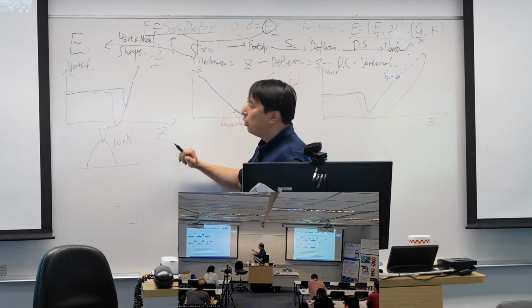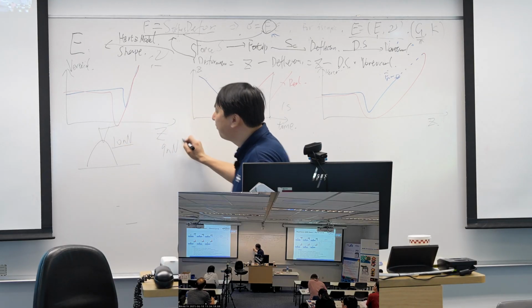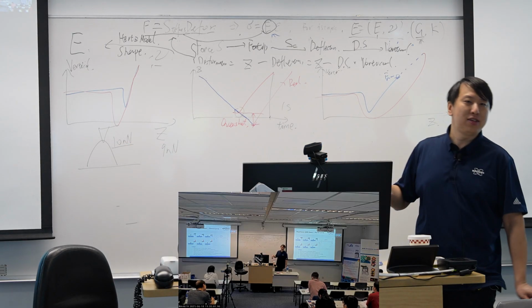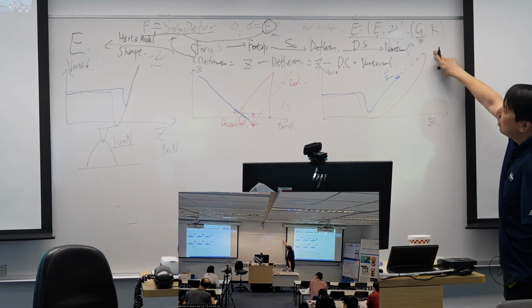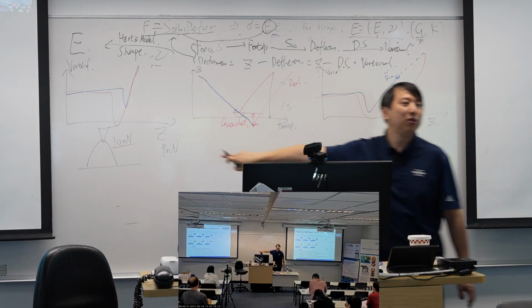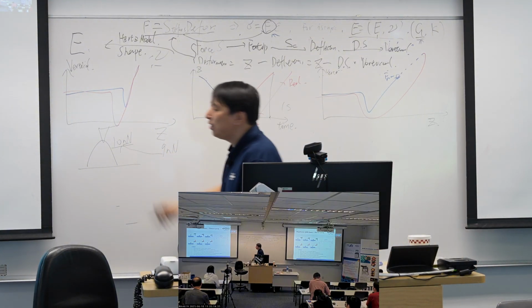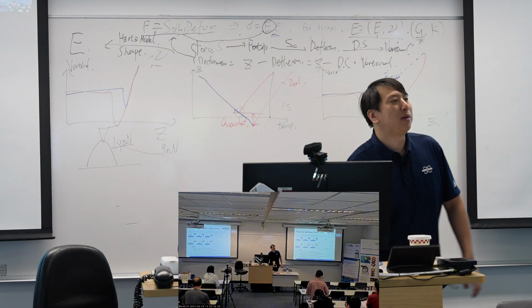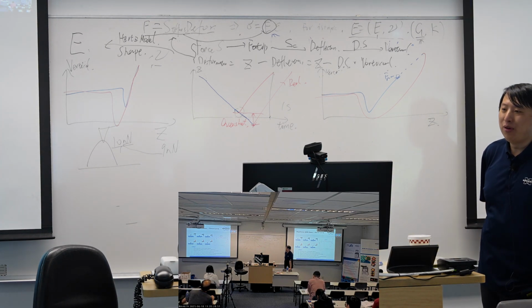You set your force to 9 nanonewton, and you think it's safe. But if you do it faster, the real force will exceed your setup, and once it is over 10 nanonewton, it will damage your sample. That's the key point here.